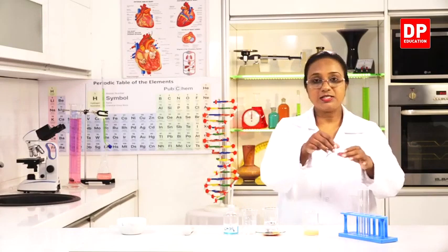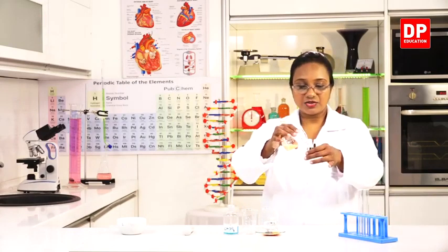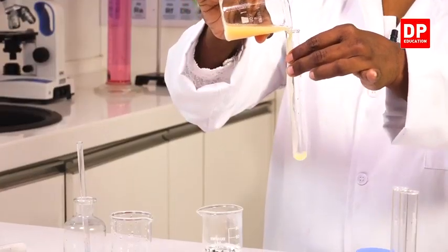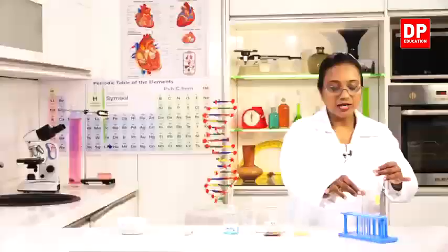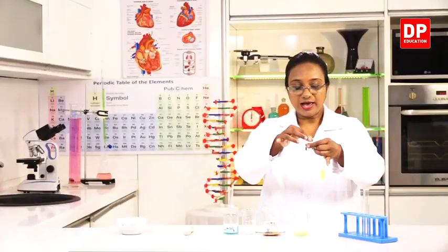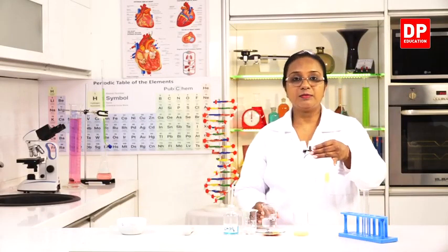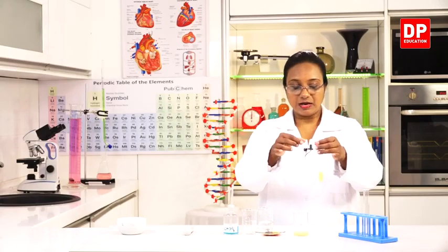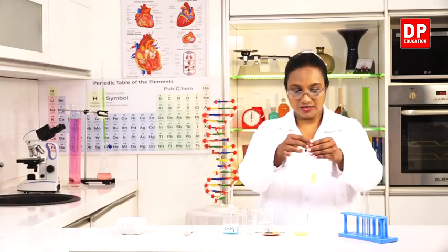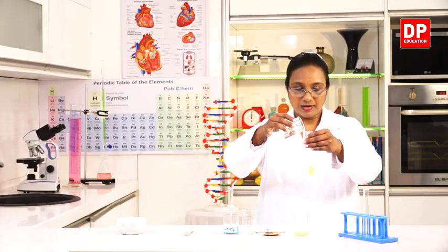I'll be using a test tube, taking a small amount of the dal extract, and into another test tube, you will have to take either an equal amount of sodium hydroxide or a slightly excess amount of sodium hydroxide. So, I'll just use the two test tubes to compare.